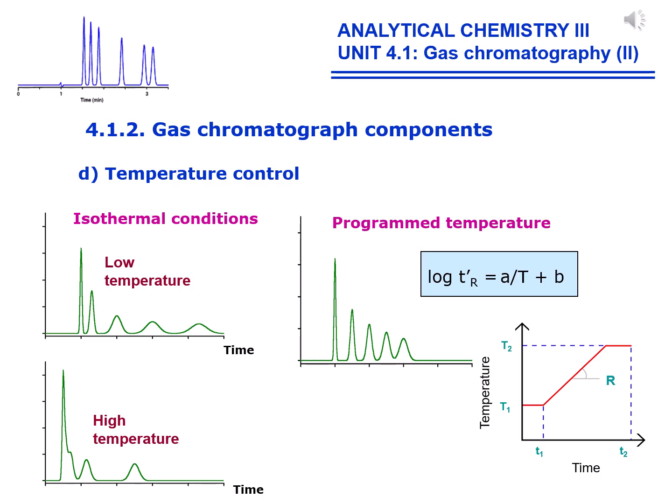Temperature optimization is essential to obtain a good separation in gas chromatography. An increase in temperature increases the vapor pressure of the components and consequently the migration rate, resulting in a reduction of the retention time, but also peak resolution. This loss of efficiency is because, working under isothermal conditions with mixtures of components with different volatilities, the more volatile components leave the column earlier and the less volatile ones are retained longer, resulting in peak broadening. This is represented in the upper left figure.